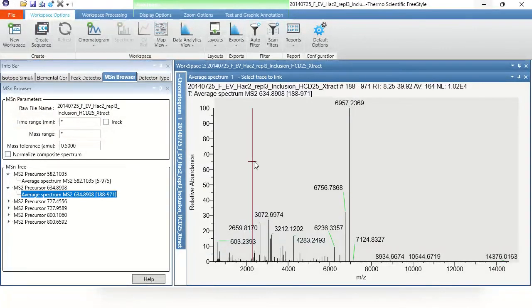It is. How wonderful. Okay, so this is an average spectrum. This is another thing that's a little hard to convey, so I'll try to walk through this. The spectrum of masses that we are looking at here is labeled in mass to charge values, but in fact the charge that we've given it is 0. So this is not a mass to charge spectrum. This is a mass spectrum where these are deconvolved masses with a neutral mass reported. So don't allow that labeling to fool you into thinking it's something other than that.